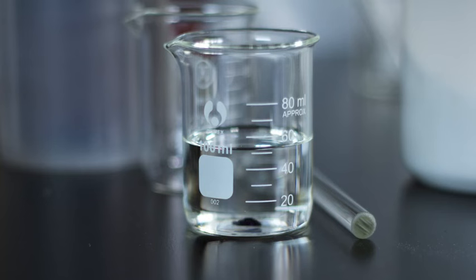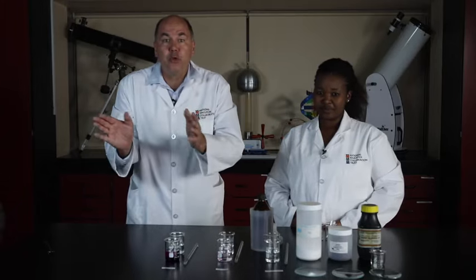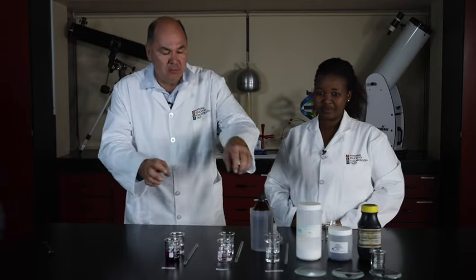Here's the result for potassium permanganate in chloroform. Write your observation in the table. We are now going to remove all 3 of these beakers so that we can get ready for the next solvent.